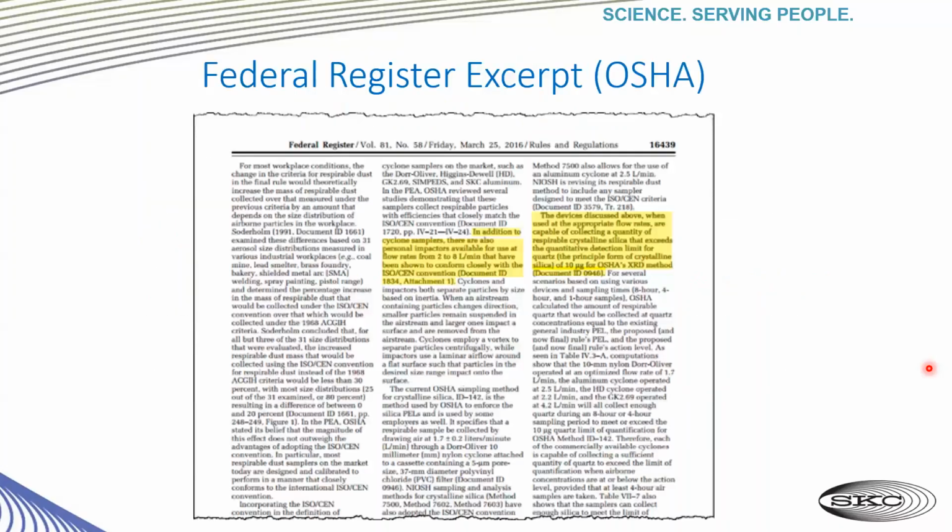This is just a snapshot of that page that I referenced earlier with the areas highlighted. So just in case you wanted to do your own research, hopefully this will save you some time by pointing out the section of the page where it is located on page 16439.